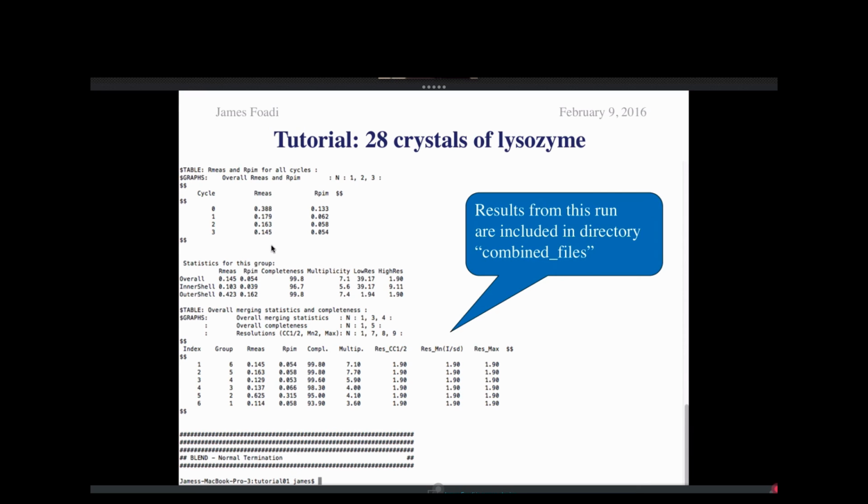Now, another variant is also available for the combination mode, and this is called the pruning variant, syntax -C. This is an automated procedure to remove images from individual datasets. And it has been thought of as an improvement on data affected by radiation damage in all those cases where the procedure carried out in the analysis mode is not successful enough. Due to time constraints, I cannot provide details for this variant here, but plenty of explanation is available in the documentation.